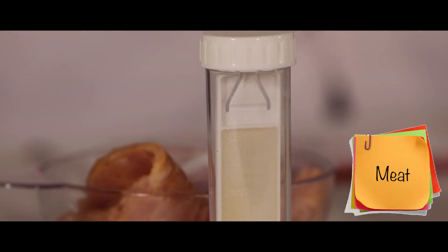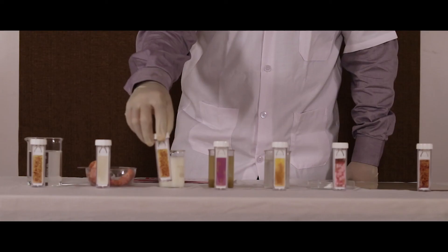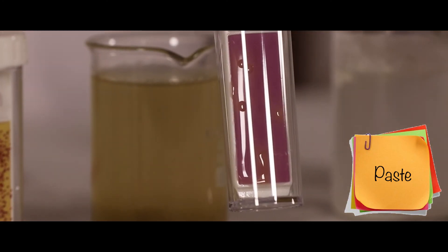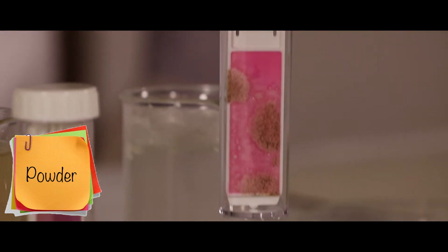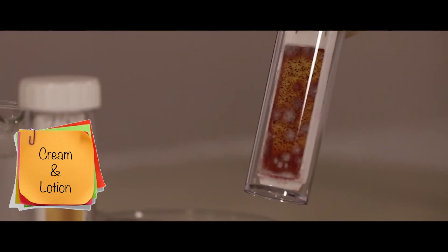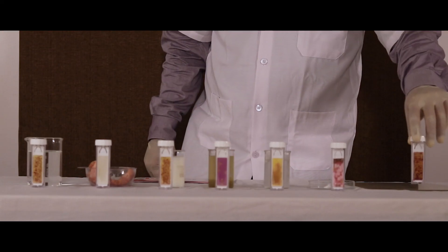Results shown for the following sample types: water, chicken, milk, ginger-garlic paste, powder, body cream, and flat surface.